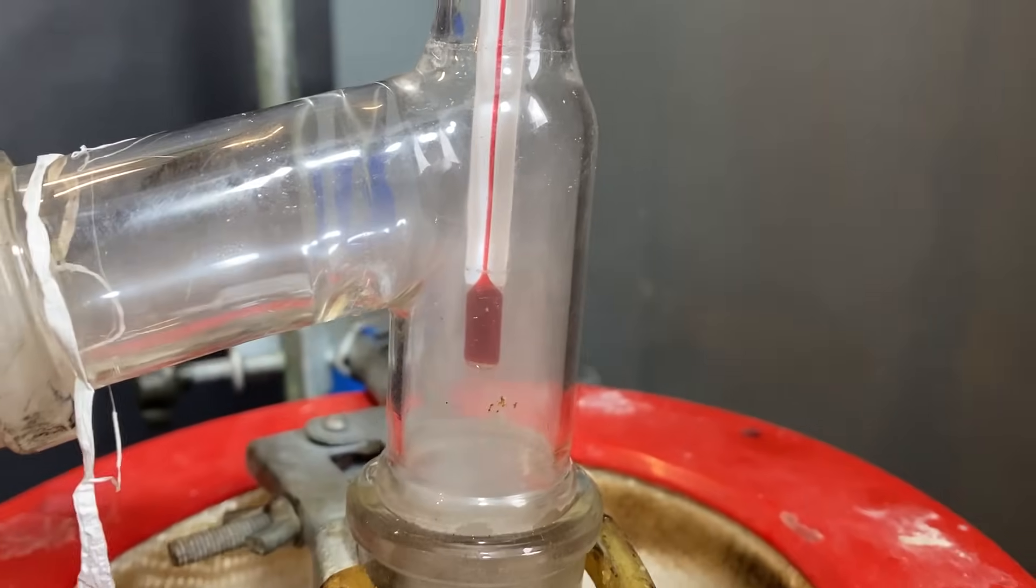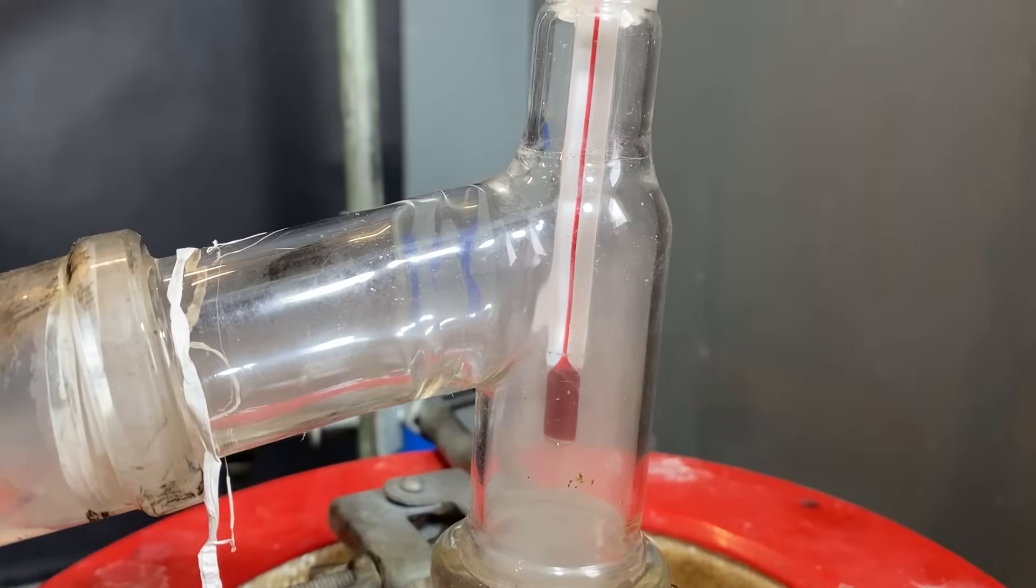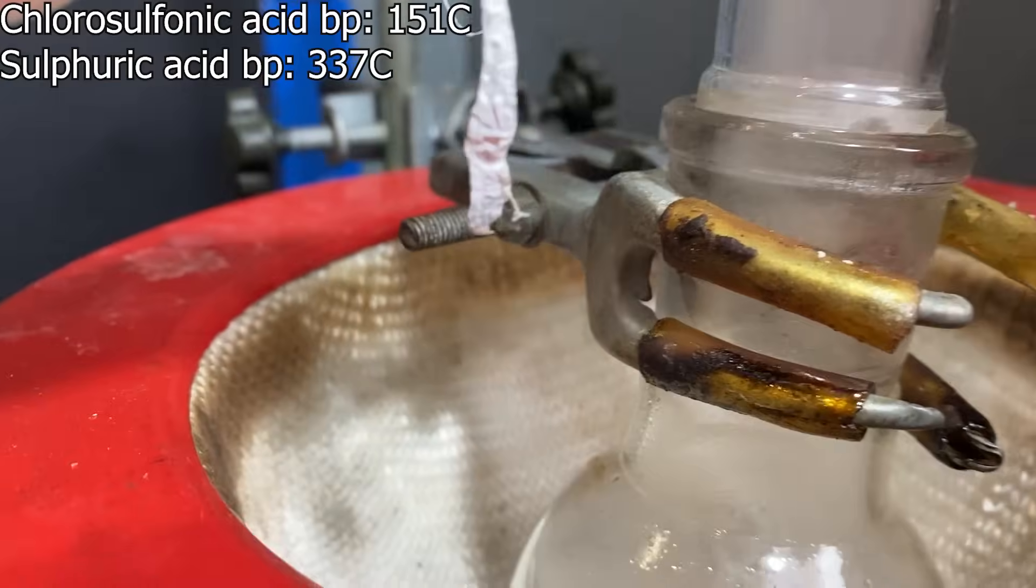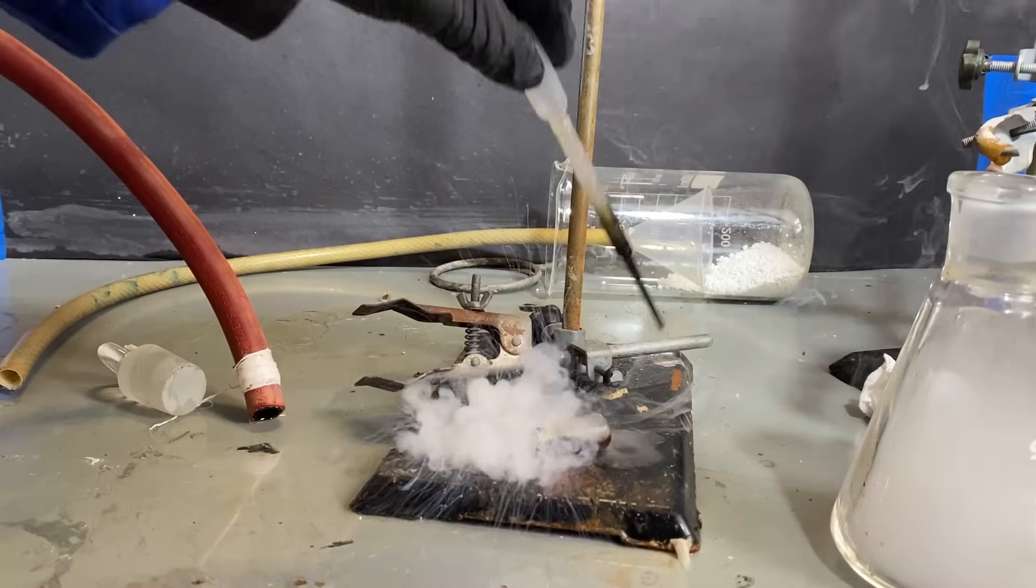Anyway, I've distilled the whole thing to separate the superacid from the sulfuric acid, which is surprisingly easy, actually, because of the difference of the boiling points. Anyway, I've bottled it, and I totally didn't spill it again.